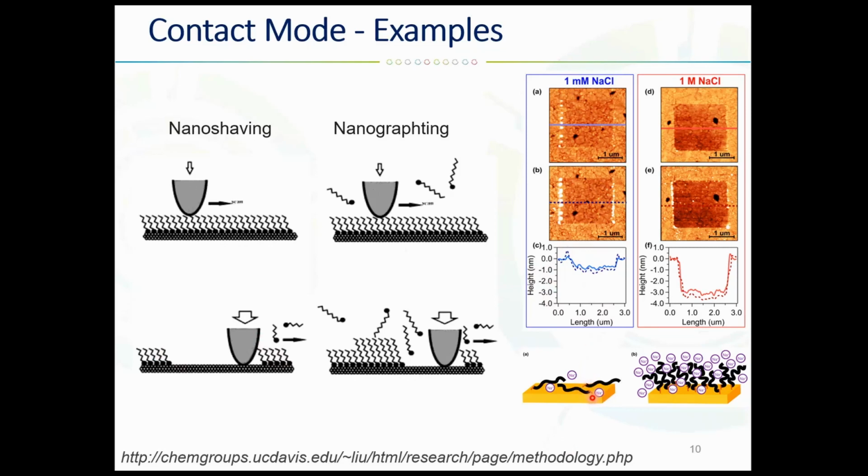So you can see that the concentration of these strands is much lower in comparison with the experiment when we had high ionic strength. So when you have a lot of ions in a solution, then this allows DNA strands to be more or less perpendicular to the surface that we are immobilizing.